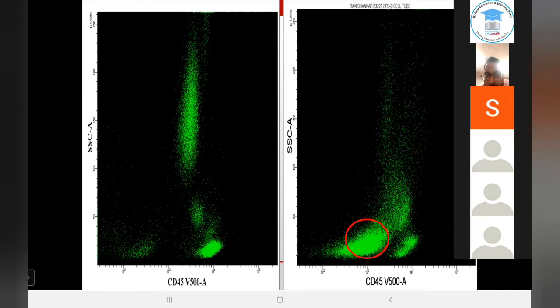Clearly abnormal. So you have a lymphoid population here. Always remember that there is a tiny population of lymphoid cells, even in largely abnormal samples. You always have that tiny 1 or 2% of lymphoid cells, which helps you understand that this is a dimmer population, because this is the normal population, and there's a small gap that you always see.